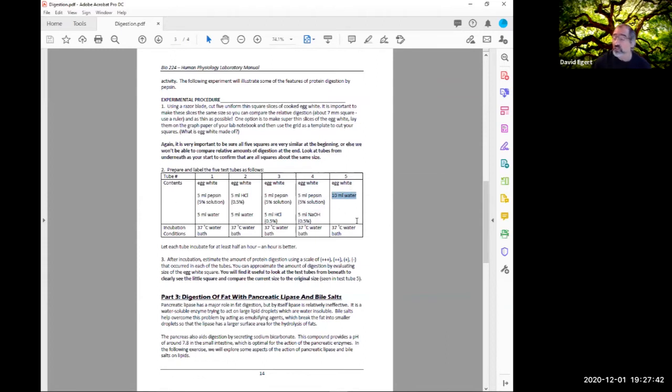So for each of these 5 things, after they've been sitting for an hour, what do you expect? Do you expect the egg white to be broken down or not? Broken down a little, broken down a lot? And again, why? There are 5 little mini hypotheses.